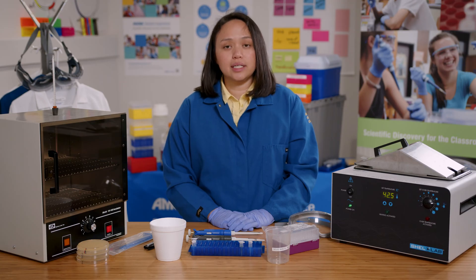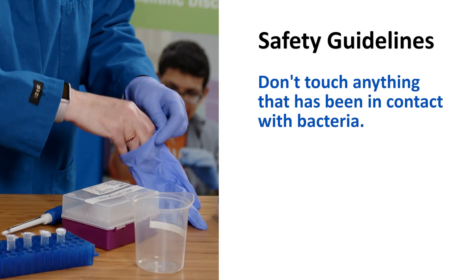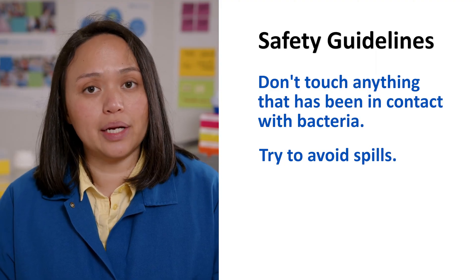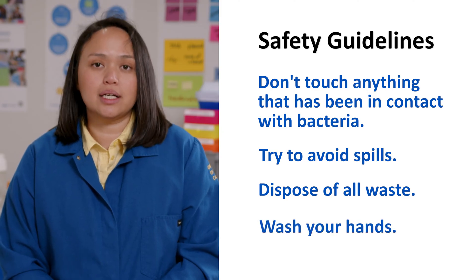It is important to use aseptic technique whenever working with bacteria to prevent contamination. The bacteria in the ABE labs are not pathogenic — they've been specifically engineered to be safely used in the classroom. But it is still important to follow all safety guidelines. This means you can't touch anything that has been in contact with bacteria. Try to avoid spills, but if something does spill, notify your teacher right away. Dispose of all tips, used tubes, and spreaders in a waste container as directed by your teacher.